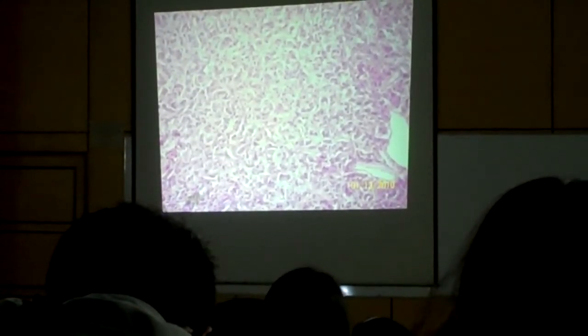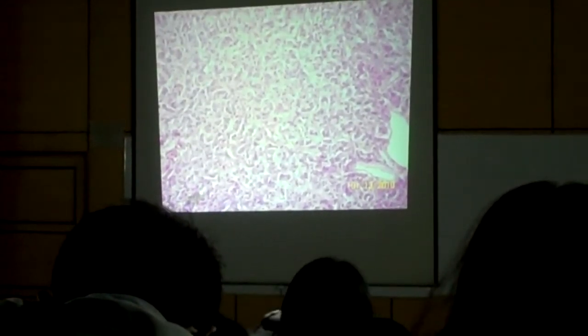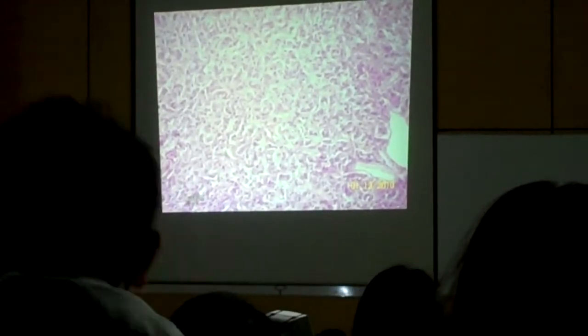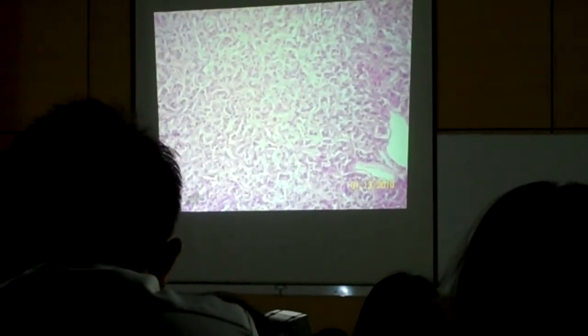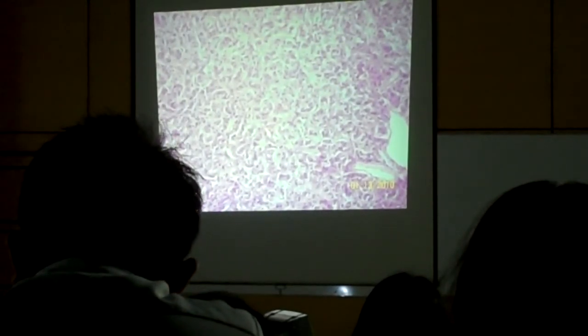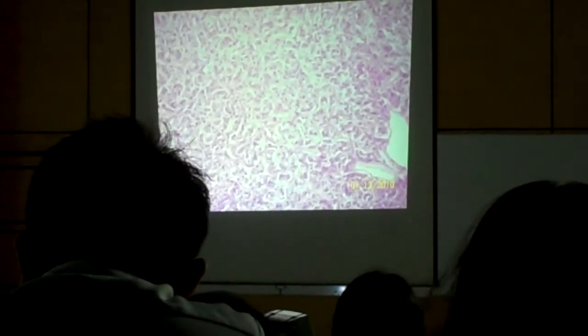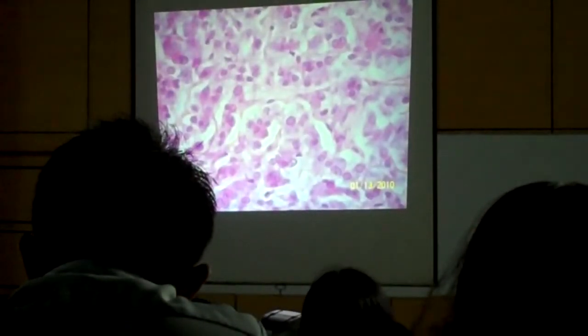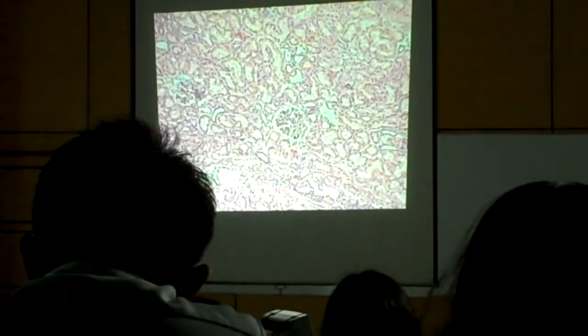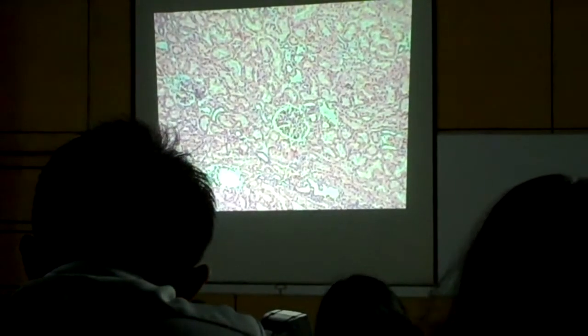Okay, of course not. You will need comparison from the other layers. So when it is focused, the entire thickness will be shown to you under the microscope. Okay, the same.